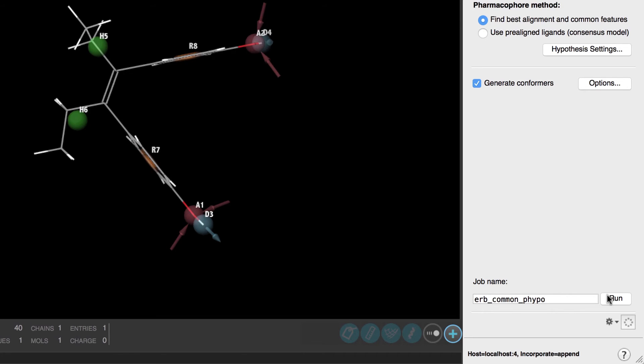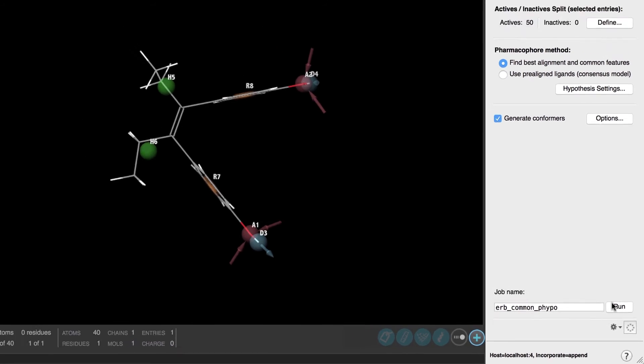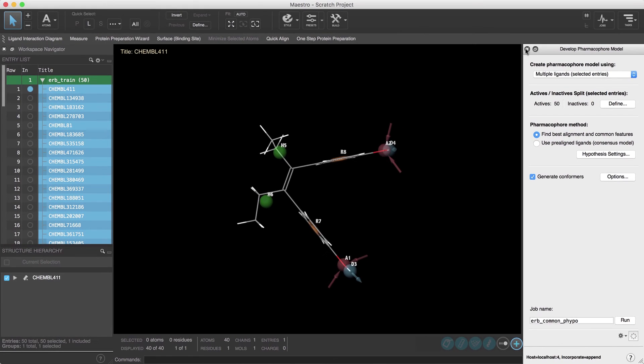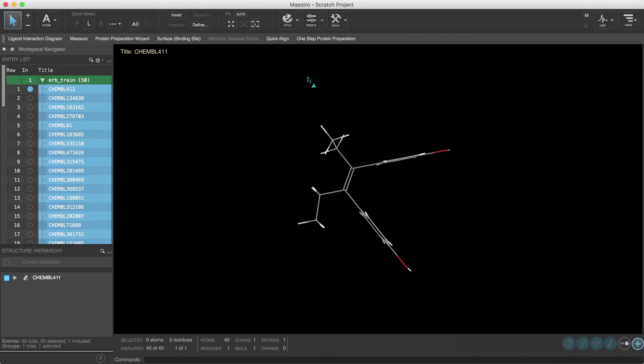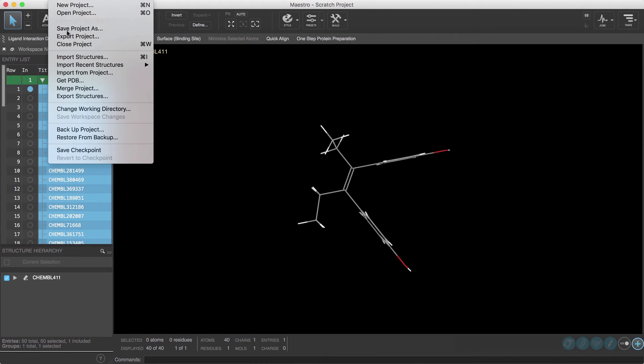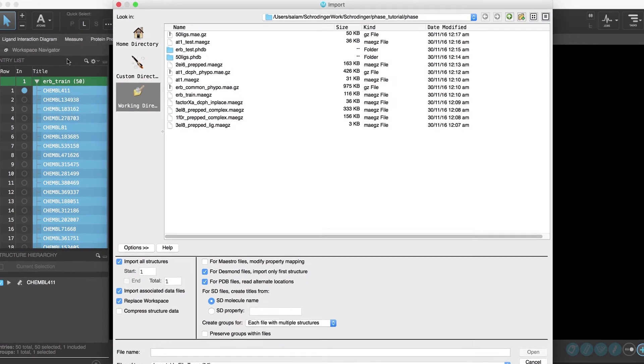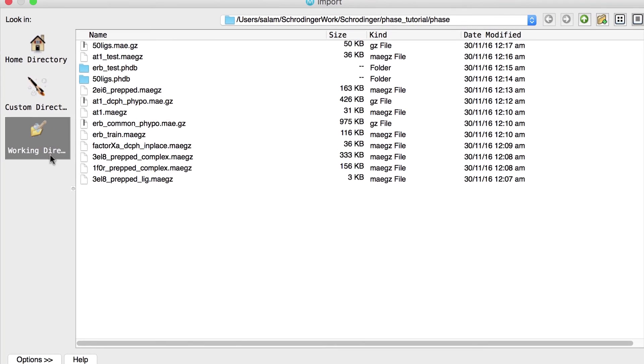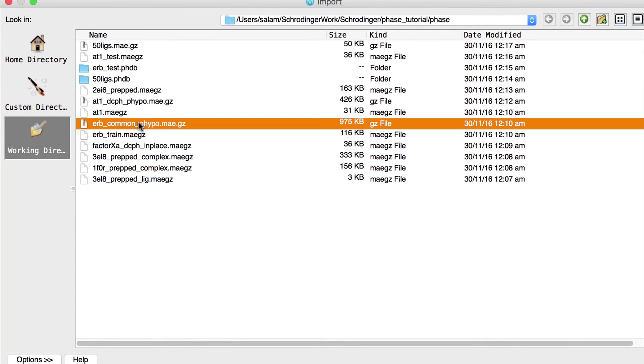Now you can either click run to start the calculation or if you're following along using the phase tutorial go ahead and close the panel then import the results manually by choosing file import structures and choose the file ERB_common_PHYPO.